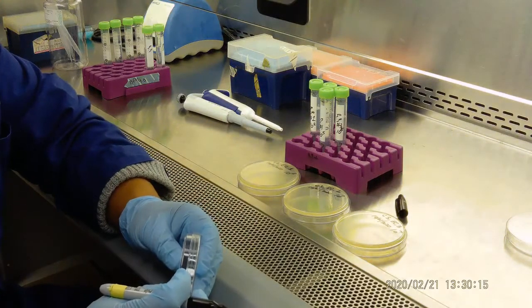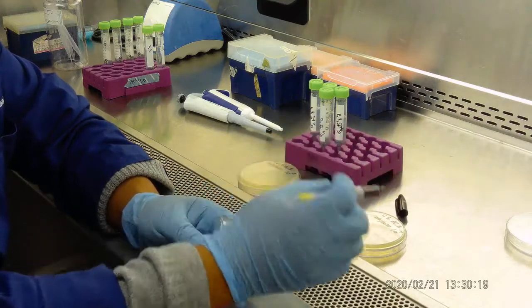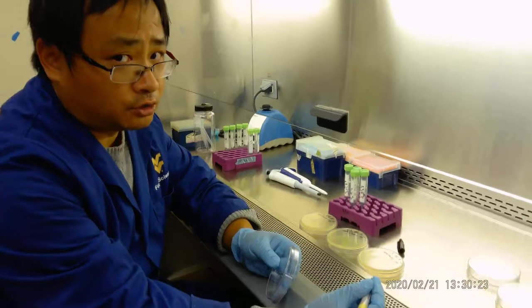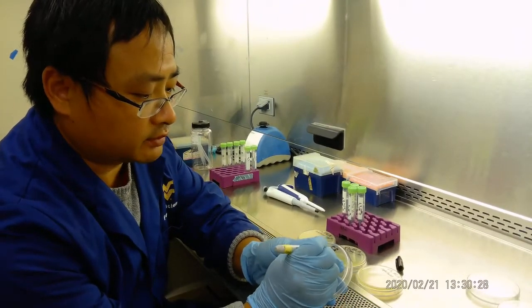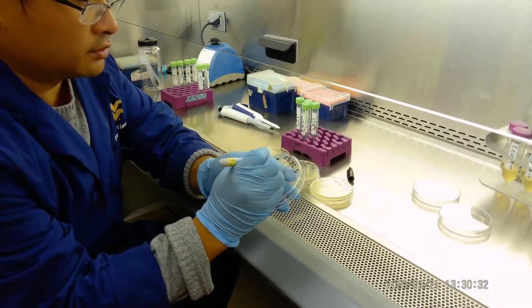But here we will be doing the dilution a little bit lower, because with the pour plating you have a mild heat. The mild heat will actually kill some of the bacteria. So we're going to label a little bit lower. We do the same thing, label at the bottom: bacteria name, your bench number, date.